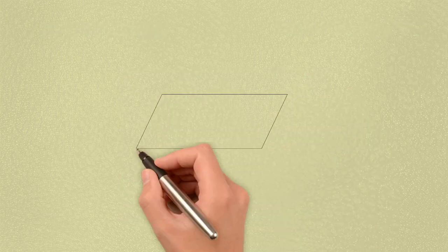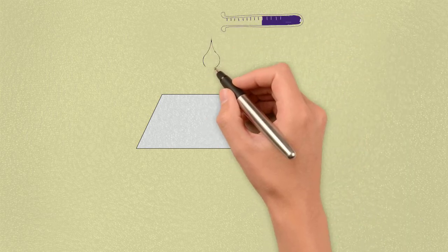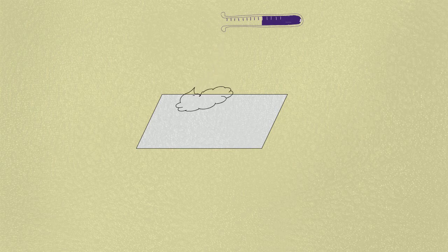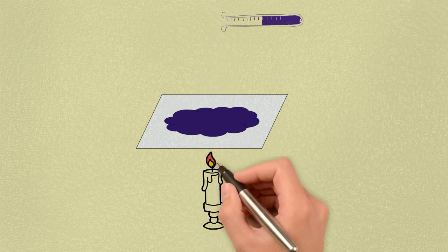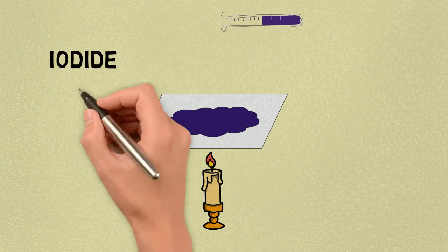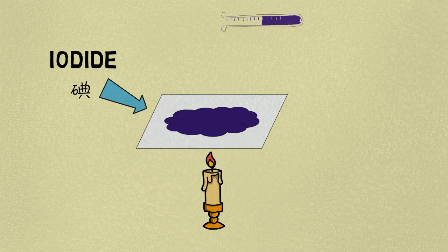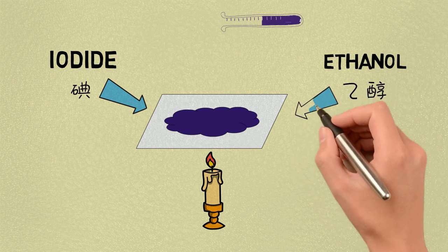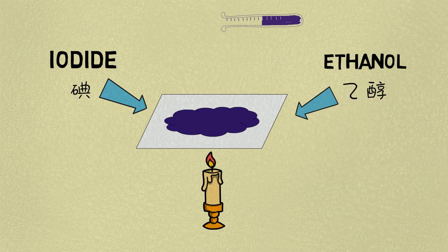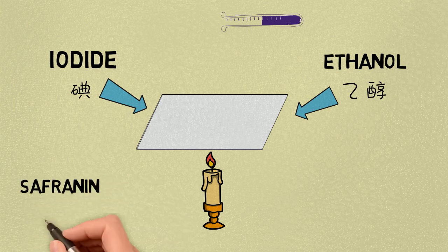There are 4 basic steps of the gram stain. Applying a primary stain, crystal violet, to a heat-fixed smear of a bacterial culture. Heat fixation kills some bacteria but is mostly used to affix the bacteria to the slides so that they don't rinse out during the staining procedure. The addition of iodide, which binds to crystal violet and traps it in the cell. Rapid decolorization with ethanol or acetone. Counterstaining with safranine. Carbol fuchsin is sometimes substituted for safranine since it more intensely stains anaerobic bacteria, but it is less commonly used as a counterstain.